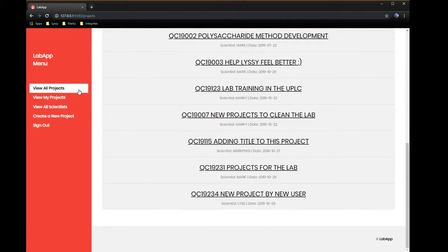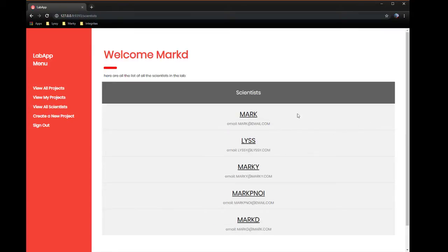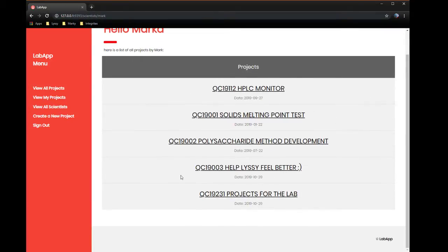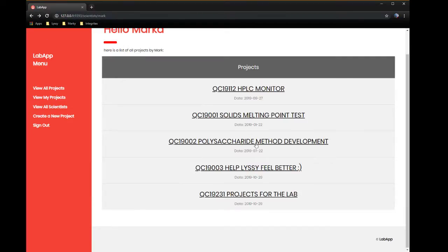But if I wanted to see just the projects from a particular scientist, all I have to do is click on their name, and now I have access to all their projects, and I could take a look at what they're working on, and I can't edit it because I'm not the owner of this project.